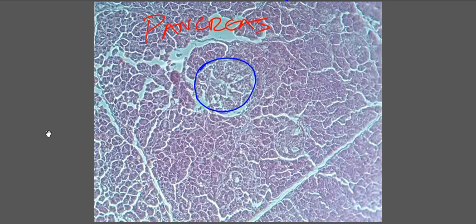All right, another group wants to help. The islet, right? I think it's pancreatic. Oh, slider. Now, that was kind of hard to see, but if you look closely, you can see how it's lighter, differently than the surrounding. Now here, we magnify into that one.